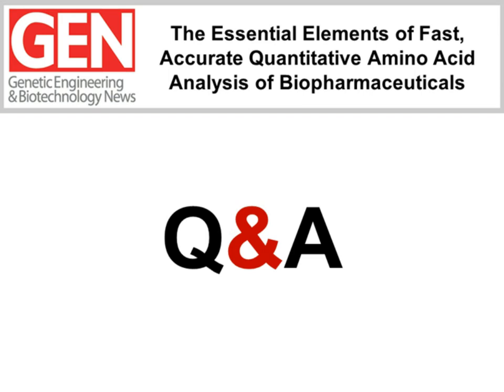For example, instead of using 70 microliters of borate buffer, we would use 60 microliters of borate buffer and 10 microliters of 1 molar sodium hydroxide. The sample that has the additional base should have a higher proportion, especially of aspartate and glutamate. And that would be our normal way of approaching salt.